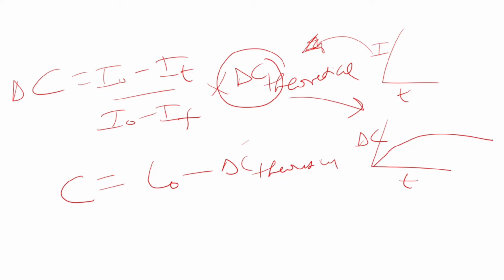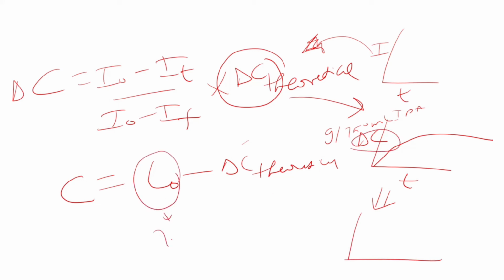By the way, delta C is expressed in our experiments as grams per 750 ml of IPA. And from this we can convert, since we have delta C and we know the initial concentration, something like 76 point some grams per 750 ml. So just subtract this value from 76, and you will get something around like this. Once you have concentration versus time, we know the solubility concentration.